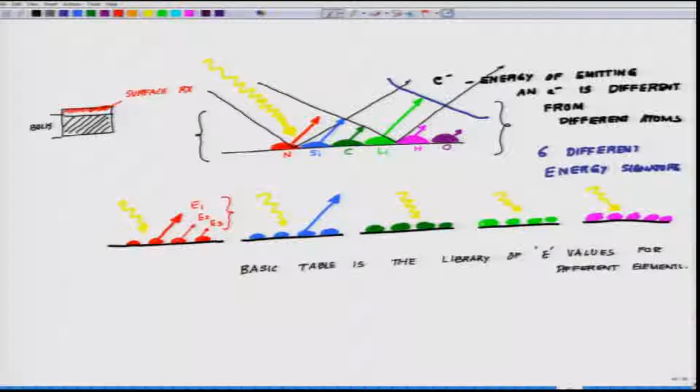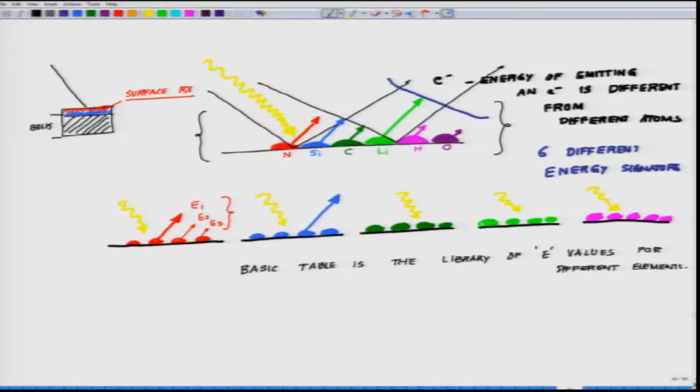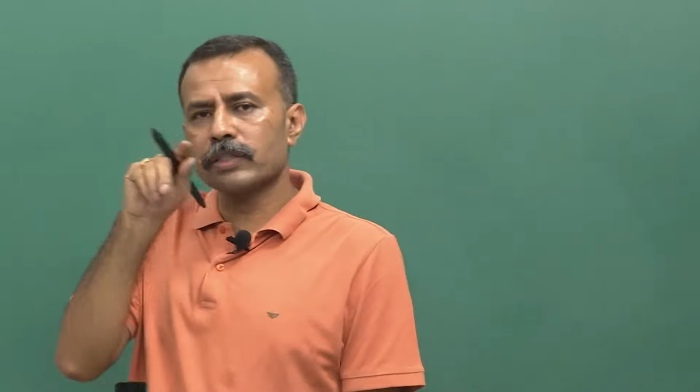Surface reaction. And of course, there is always a very interesting interface. So we are not talking about it. Any surface phenomena needs to be analyzed very analytically for the presence of different kinds of elements, because unless you know this, say for example, think of this, suppose your surface has higher carbon. So now, having said this, I will take you to the next slide.